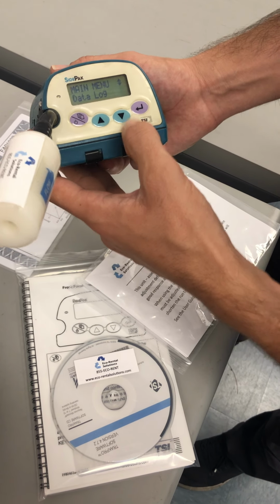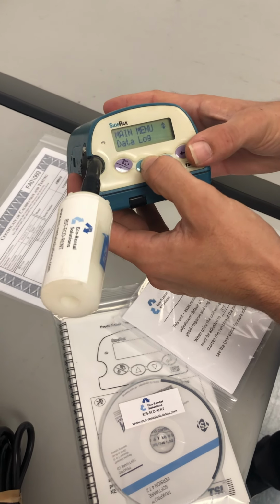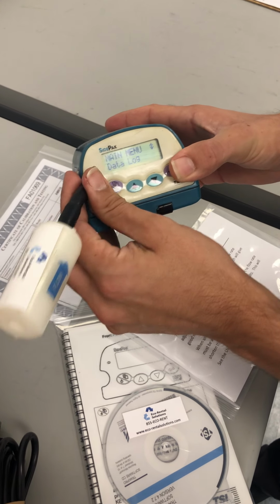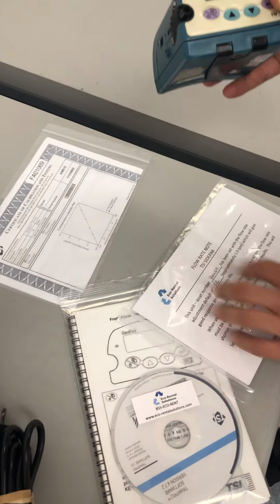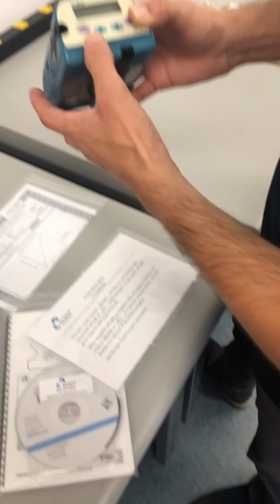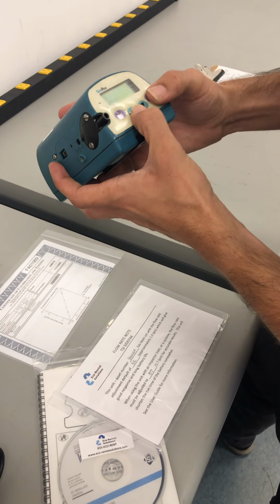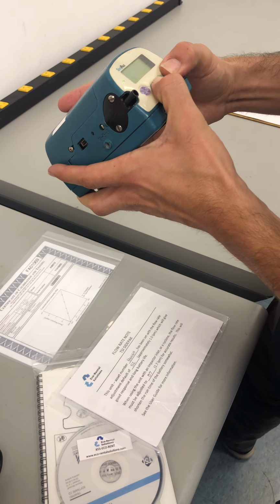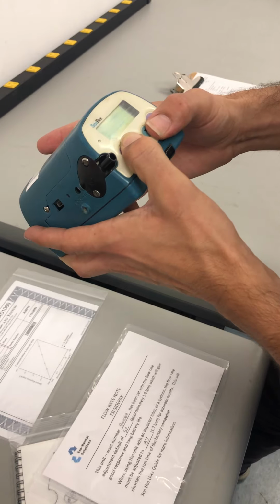So let's see where I can find, I think in order to get to that adjust flow. Well, we'll never need to get to that, right? Because we're most likely only taking one measurement here, and you're always going to be using the impactor. That's correct. And you're only always taking the PM10 value. Yes, sir. I don't know if we need to get into that. Let me just make sure it's on the right one. Yep. Okay. So maybe you don't have to worry about that.